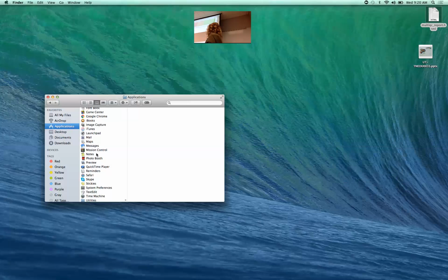Here you can see the heat map. When I look at it, there's this region right here where the color looks a little different. So if I click, we see kind of a standard, and then you can click next, next, next. We look super consistent, pretty consistent, pretty consistent, pretty consistent. And then eventually, okay, so that one looks a little different. Don't really know why.